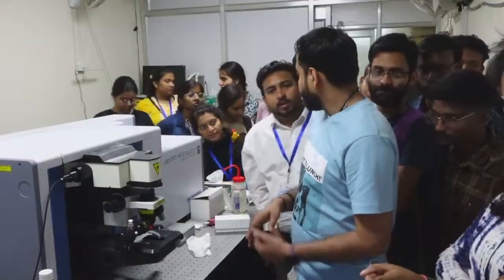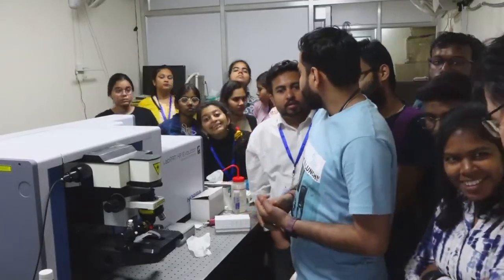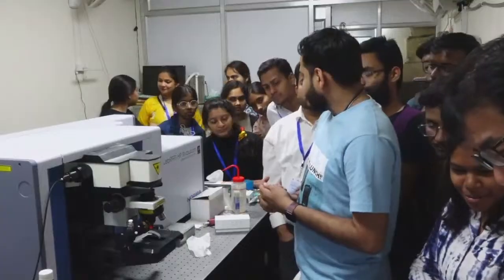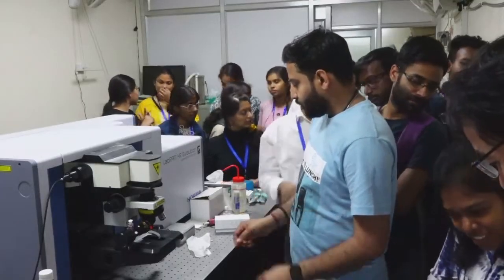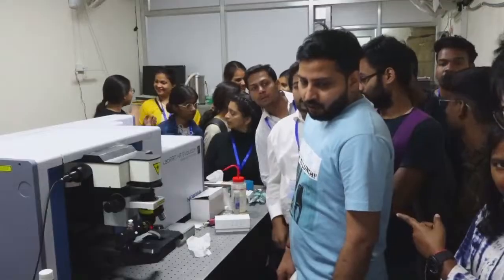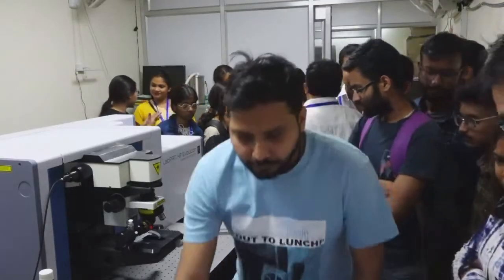Why is it coming in this position all the time? I am thinking it may be some defect. The position may vary, but all the time it is coming at that position, in the previous measurement also. There is some problem in the detector. So it happens.